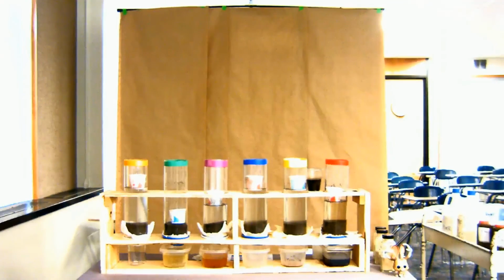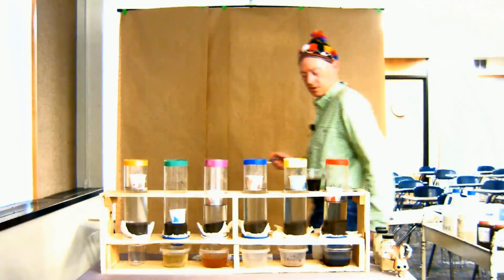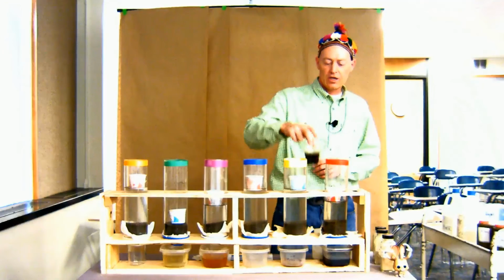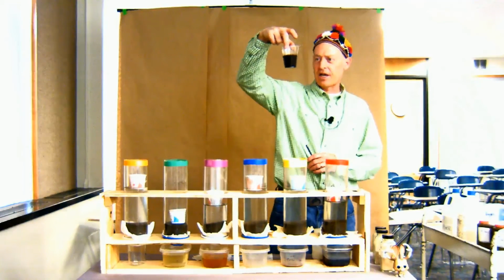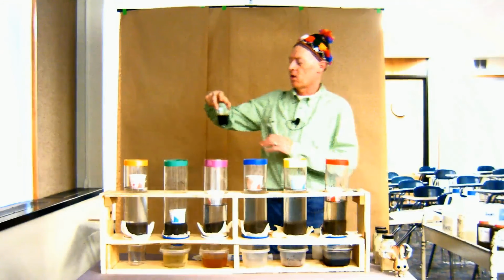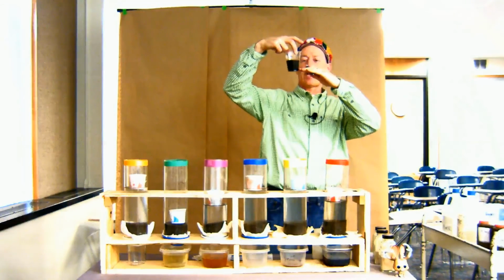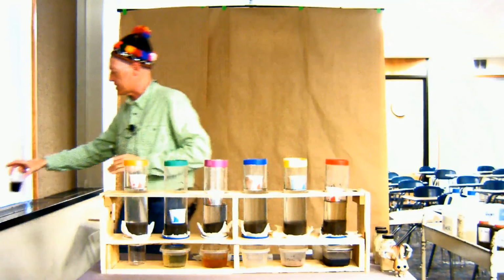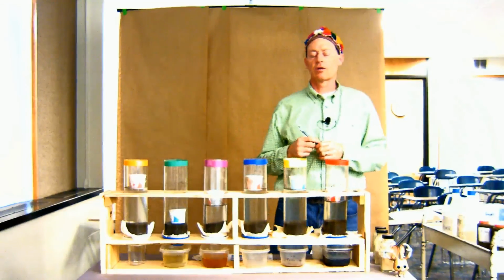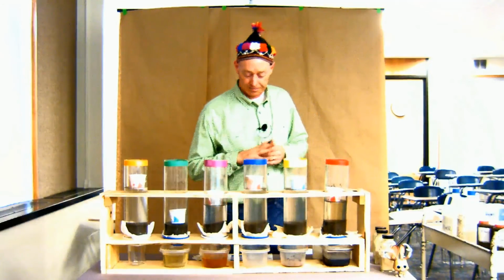This demonstration here. Okay, so what will happen, and I'll show you next time, is this will flocculate. It started, but you won't be able to see it. And then what will end up happening is it'll be clear liquid at the top, and this organic matter will have settled to the bottom. So I'm going to set this over here, and when we do our last video where we go over the exam, I'll show you that during that time.